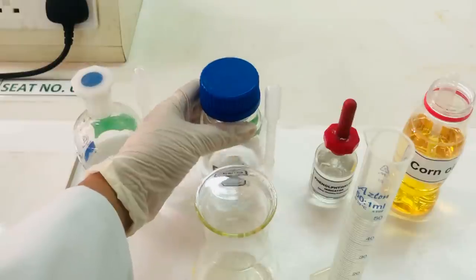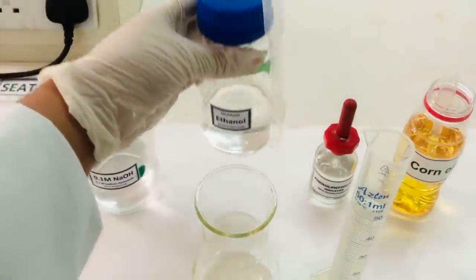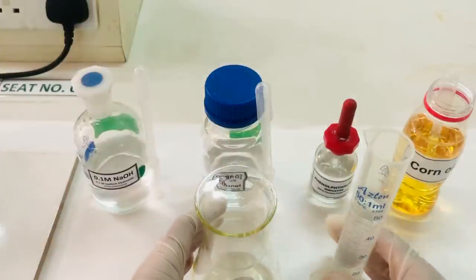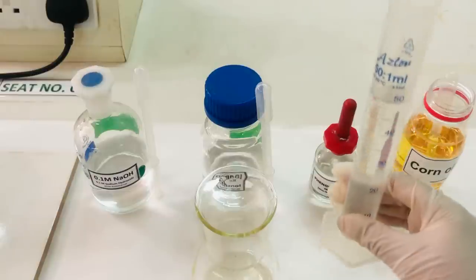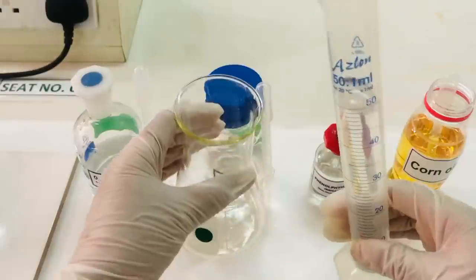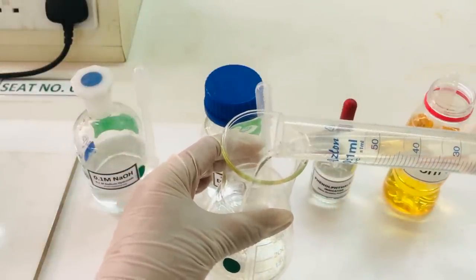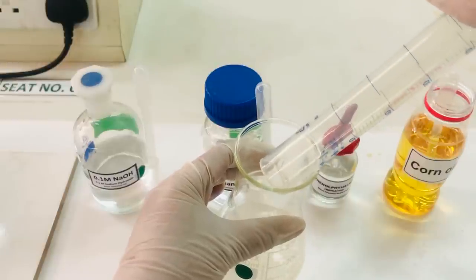neutralized solvent, ethanol in this case. We will be adding 50 ml of the neutralized solvent. We have taken 50 ml of neutralized solvent in the graduated cylinder, and this we will pour in the conical flask containing the oil sample.